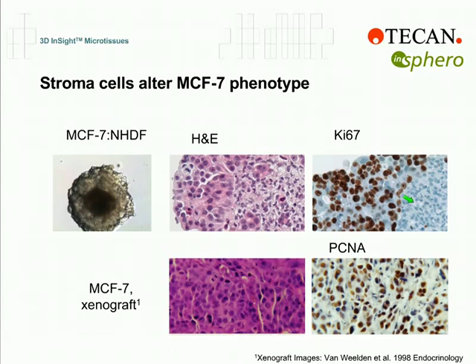And this is also a major difference between 2D and 3D model systems. Primary cells and non-tumorigenic cells do not proliferate in the microtissue model system. Only tumor cells and stem cells are still proliferative in the microtissue.